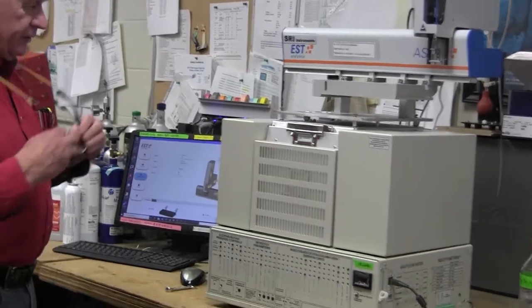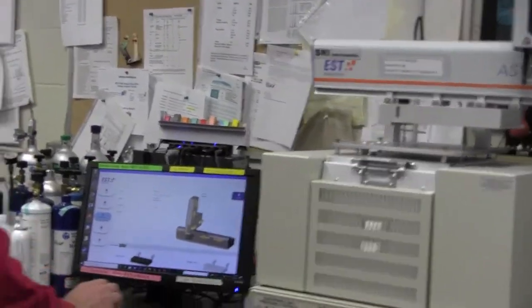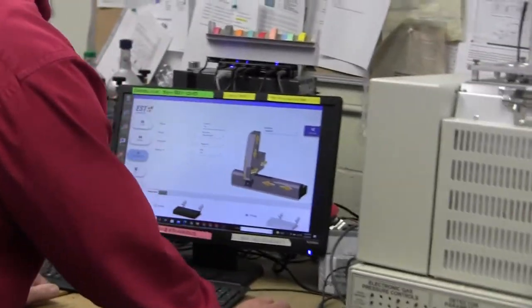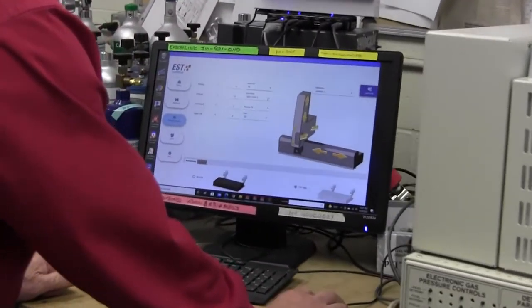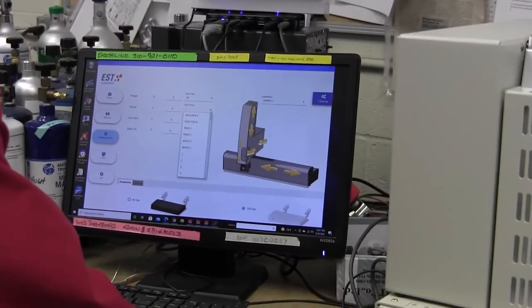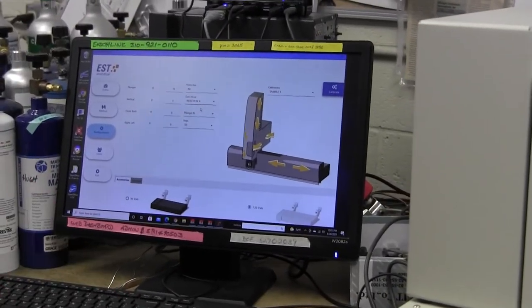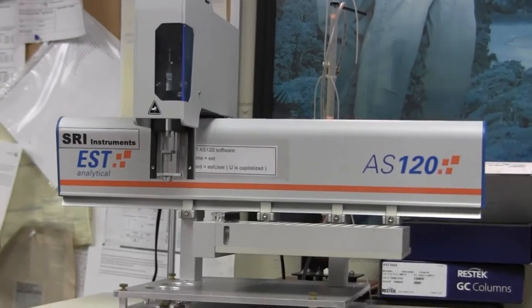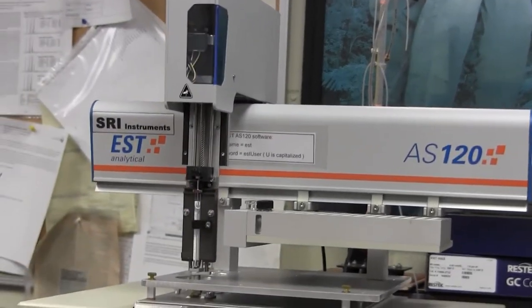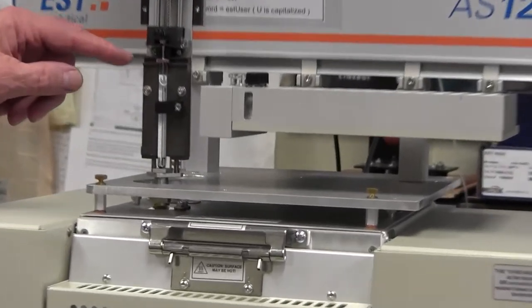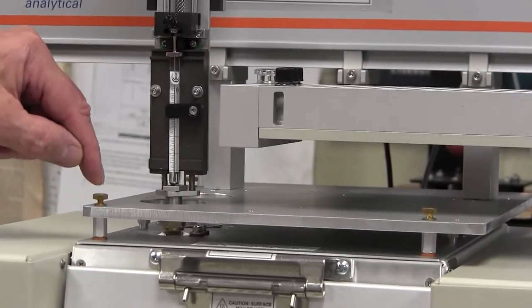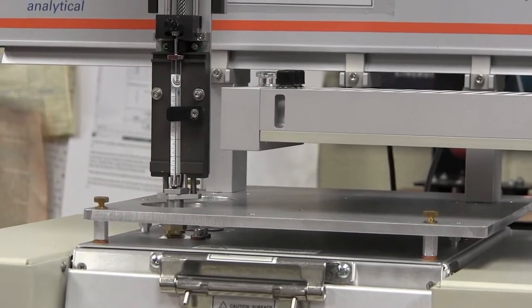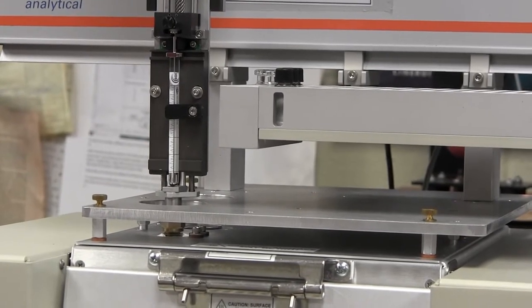So the auto sampler is kind of like a robot. I'm going to move the auto sampler to the injector position and then you can see what it does - it sticks the syringe into the injection port of the GC.